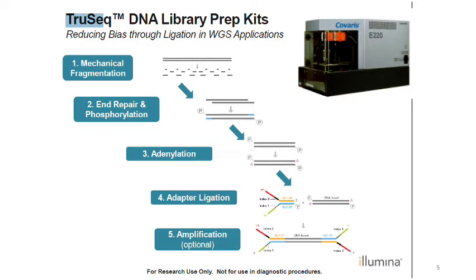Impurities such as detergents or proteins are visible as smears on your DNA gel, and RNA is often visible at the bottom of a gel. A ladder or smearing below a band of interest may indicate nicking or other damage to the DNA. Once you are sure you have sufficient good quality DNA, you can start the library preparation.